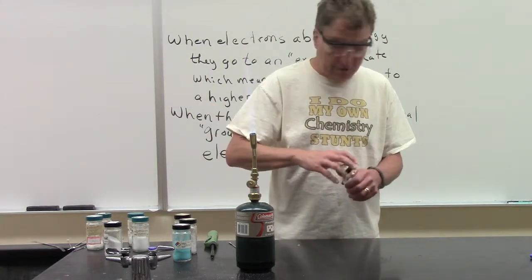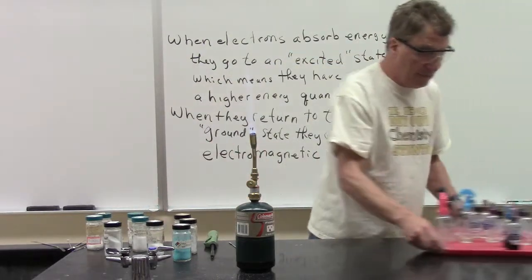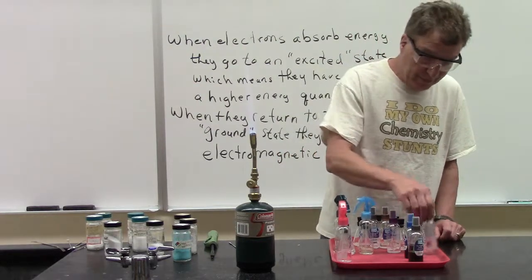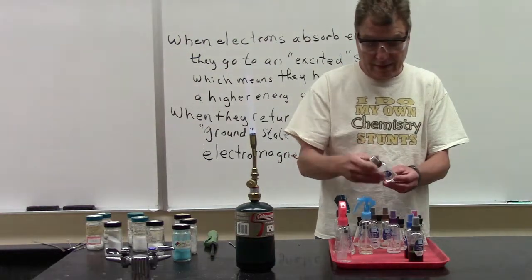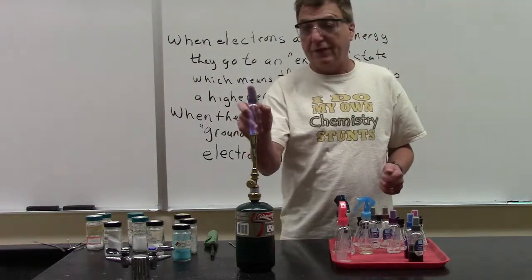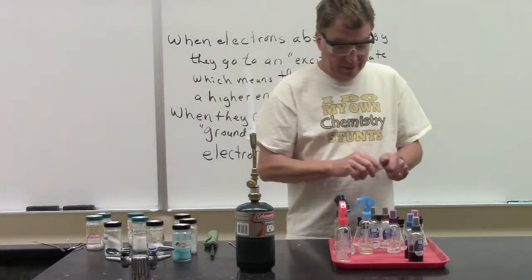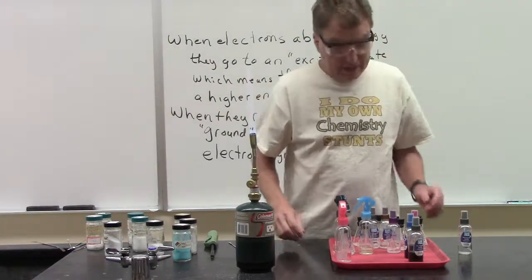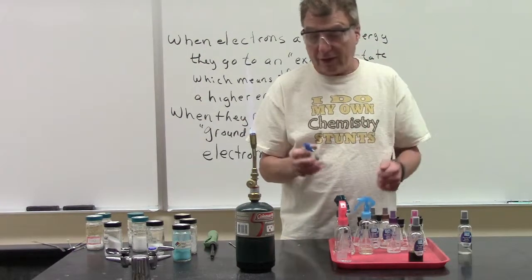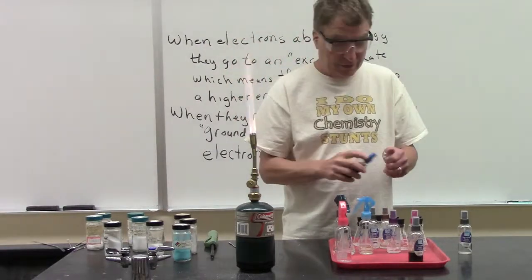We can have a little more fun by dissolving these same salts into ethanol and then spraying them into the flame. So here's boric acid, and you can see it's very green. One of the reasons I got into chemistry, because I like colors. Here's our cobalt. Remember that kind of sparkle? Well, there it is again, bright sparkles.